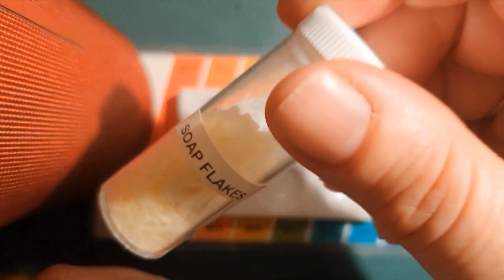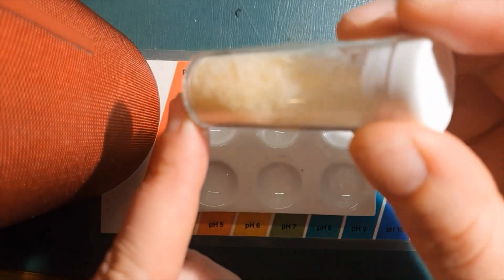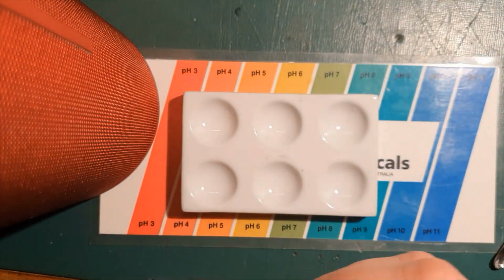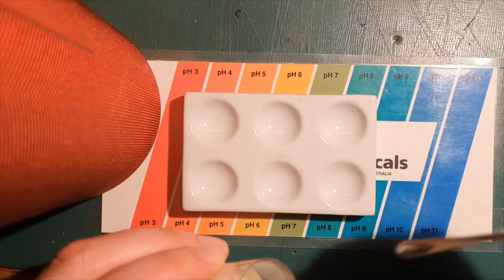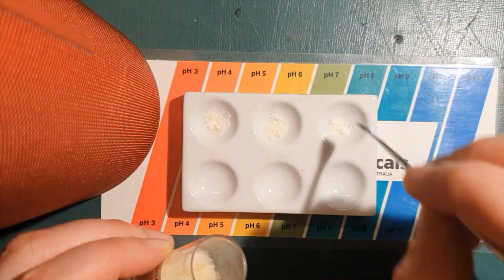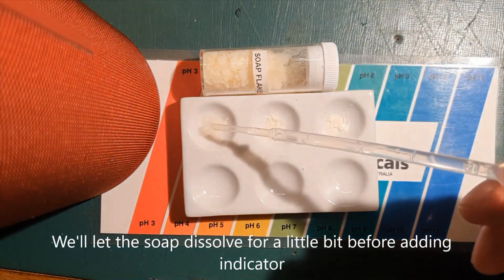Okay, so these are the soap flakes. Can you describe their appearance? Kind of look flaky and thin. So put that in the appearance box. And then we'll test it with some reagents. Get some soap flakes in there. All right. So the first one, we're going to dissolve in some water.